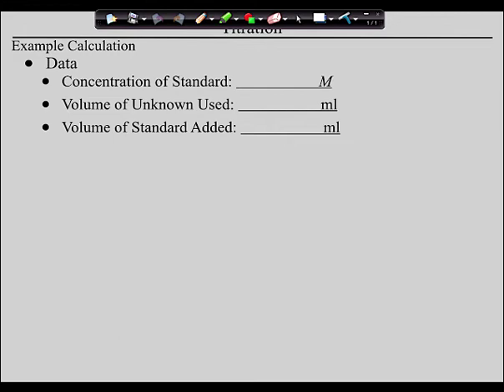So you put this in here, you turn this on, and it stirs the solution with no physical or mechanical contact between the stirrer and the motor. Pretty slick, right?